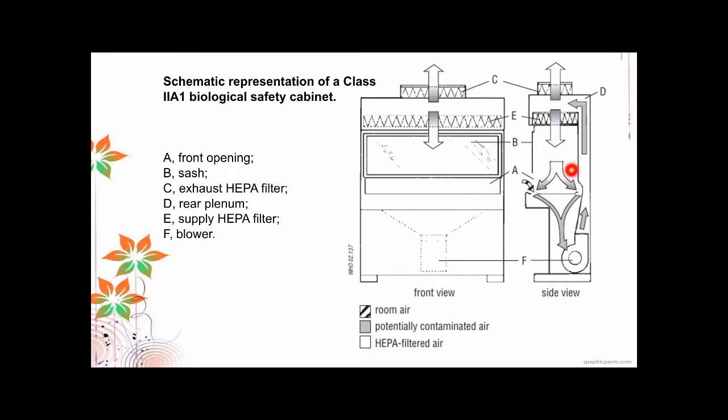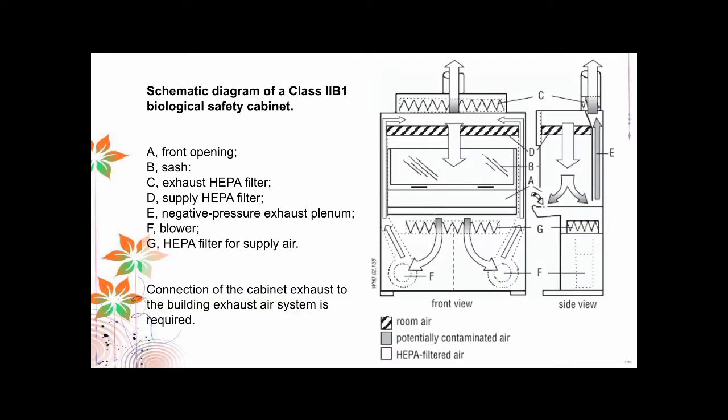So you have product protection here, and the contaminated air is also filtered afterwards. So basically, this is your class 2A1 BSC.